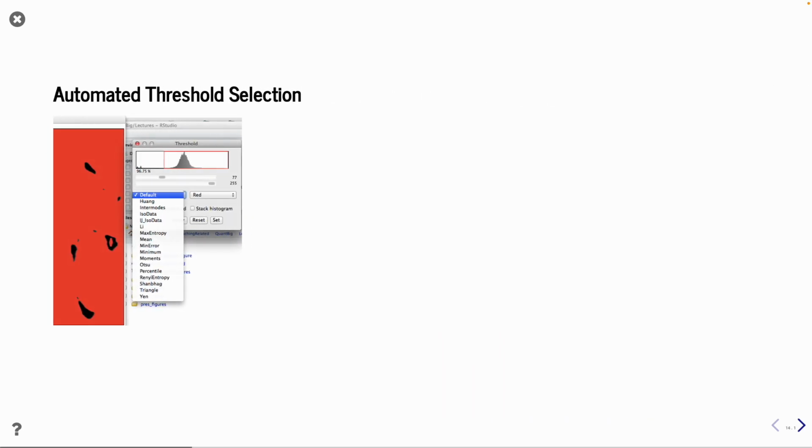Now, these were the tricky cases, but there are many cases where we actually can do good segmentations. One example is you can use existing tools. Here is a screenshot from ImageJ, where you have, what is this, like 15, 20 different algorithms for how to do the segmentation.